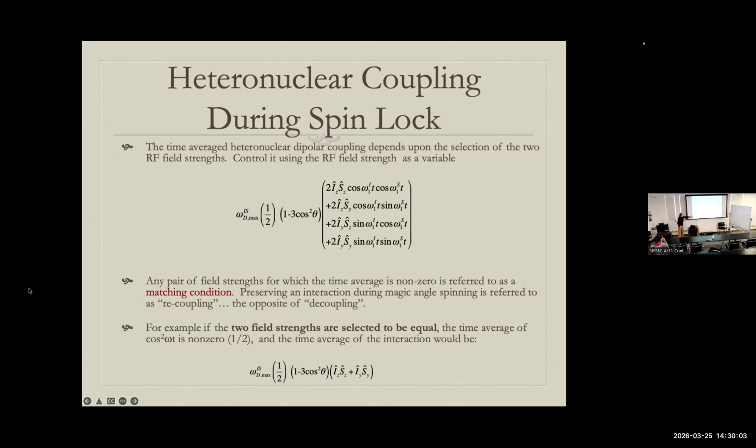This is an important slide. Applying a matching condition. And really the job tomorrow is to ask what kind of matching condition should we have? We have to throw magic angle spinning in on top of all of this so that we get narrow peaks. Make sense? So these frequencies are different. Yeah, this is your B1 dictating the Rabi frequency.